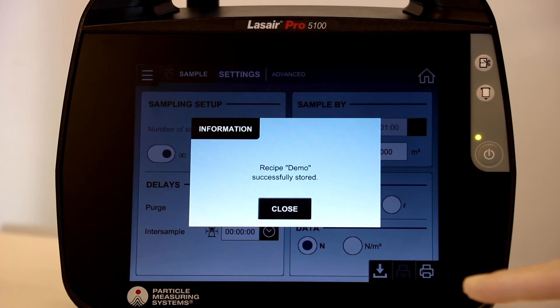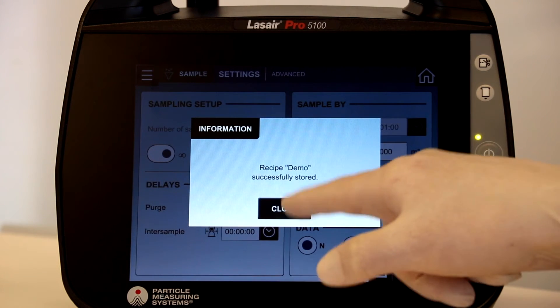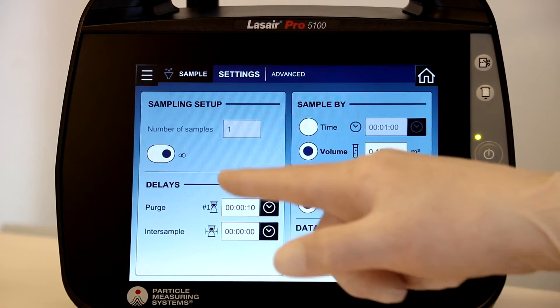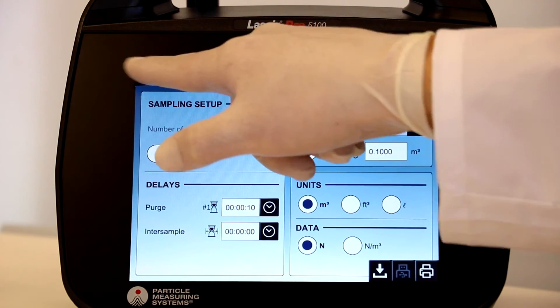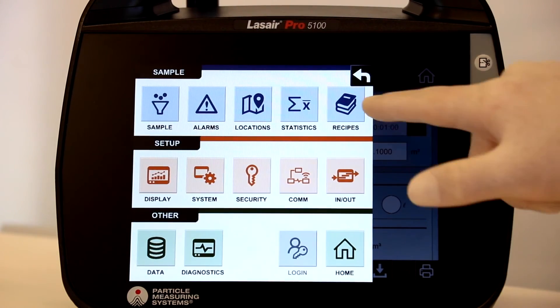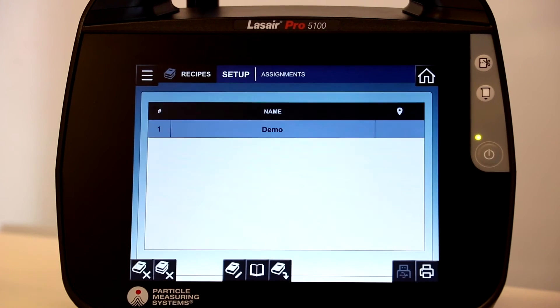A notification that the recipe has been saved appears. To confirm the recipe, you will return to the navigation panel, select the recipe icon, and view the newly created recipe.